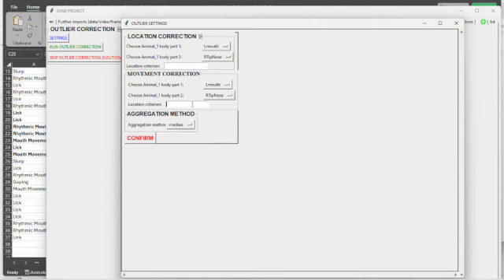For movement correction, the Golden Lab recommends using a range from 0.7 to 1.5. This is a pretty big distance for me, so I'm going to use 0.7. Again, what it's going to do is calculate the distance between the left mouth and the right tip nose for every single frame of my video.